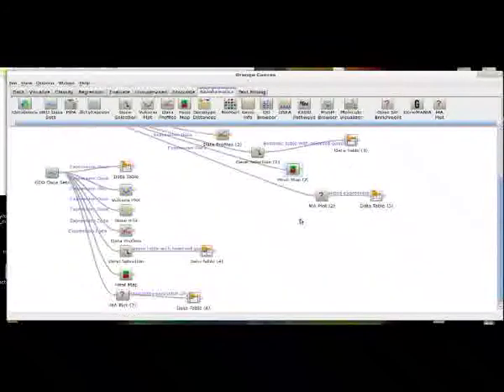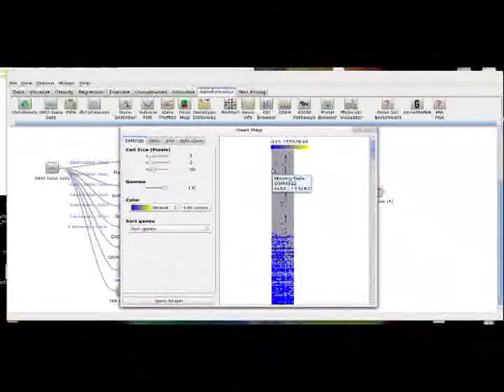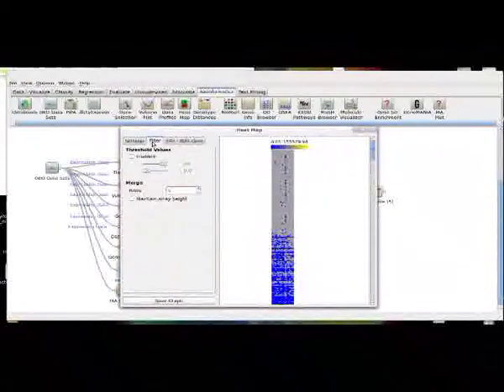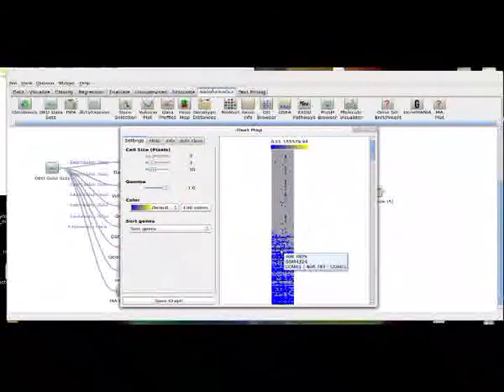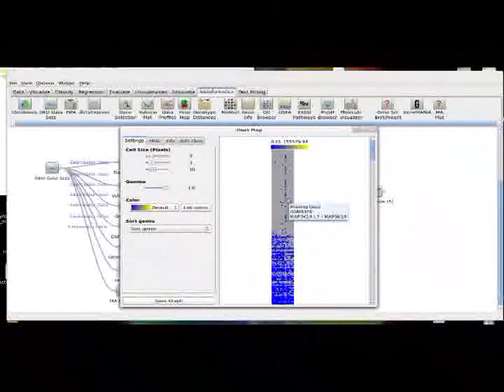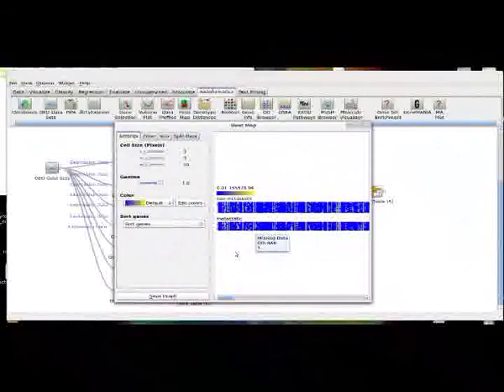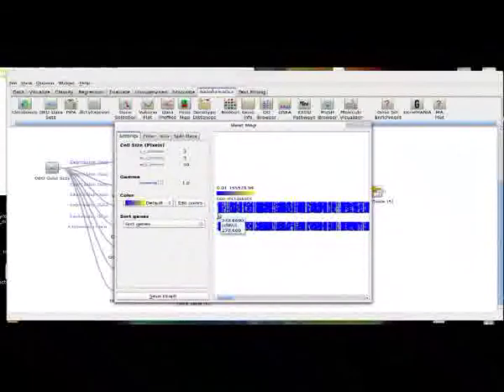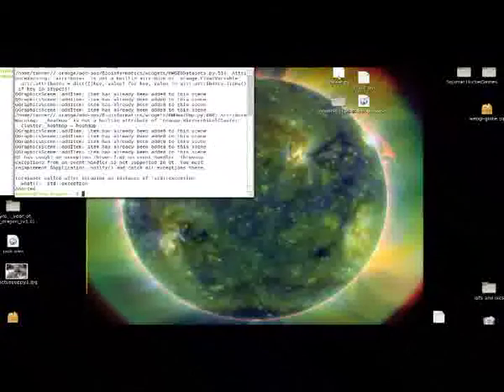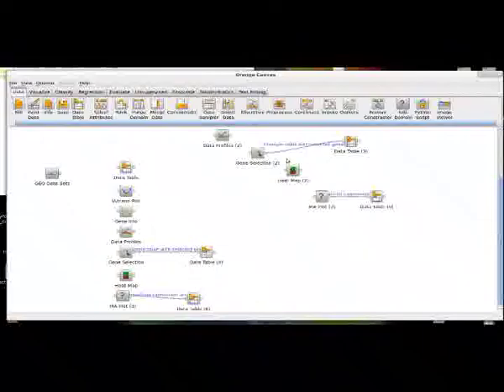So this allows us to have a nice visual analysis of which genes are affecting different tissue types. Let's take one more look at this, or our metastatic blastoma data. And this doesn't seem to be... When I look at this, now I can see individual genes. Oh, they crashed. Bear with me.